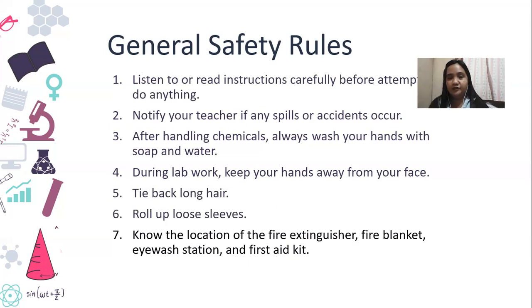So we have a fire extinguisher, we have a fire blanket, we have first aid kits, of course, and there usually is a fire extinguisher orientation. I mean, how to use the fire extinguisher so that you guys will be well versed in using the fire extinguisher. So please make sure you know the location of those safety equipment.